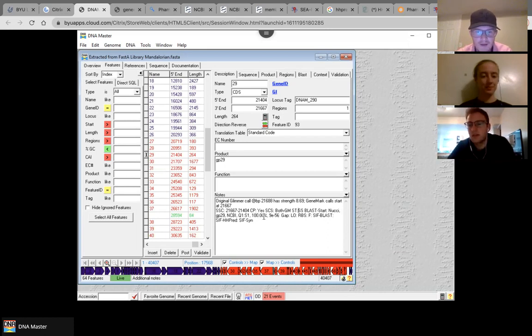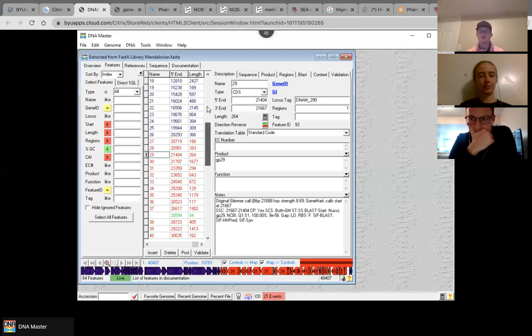Okay. And now we are on to gap. So I'm also going to talk about gap. Gap is the gap between the start of our protein and the gene before it. So when the genes are going forward, so 1 through 26, we will subtract, for example, with number 1, the stop of number 1 from the start of number 2. Is that correct? That's not correct.